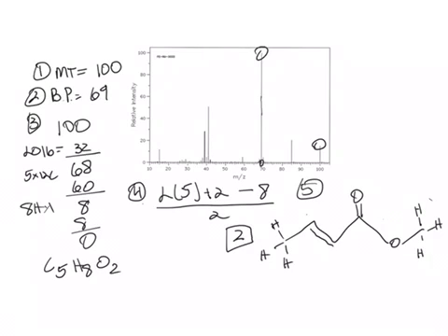So now when we look at our formula, we had 5 carbons, which we have here in this molecule. 5 carbons. We've got 2 oxygens. And then we also have 8 hydrogens. But here we've only shown 6. So the remaining hydrogens are going to be right around here. And so this would be a potential or reasonable structure for this molecule.